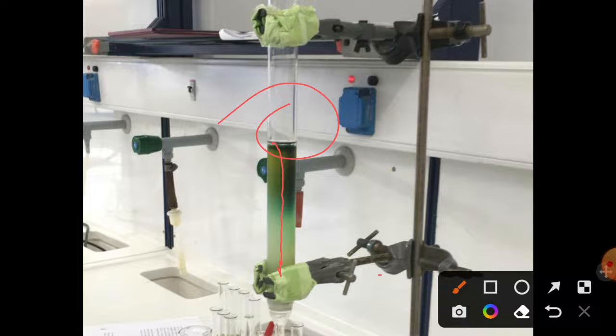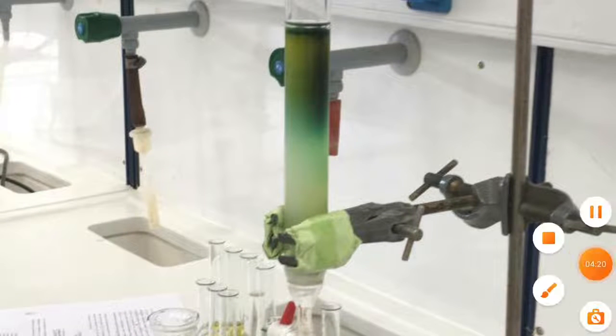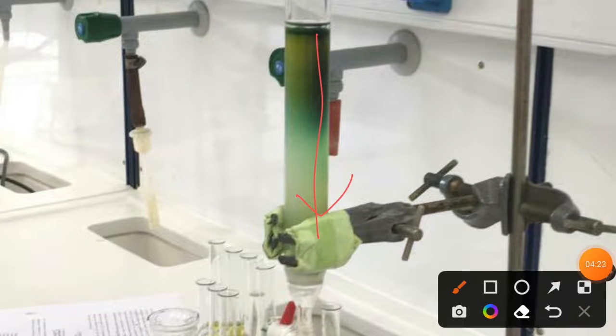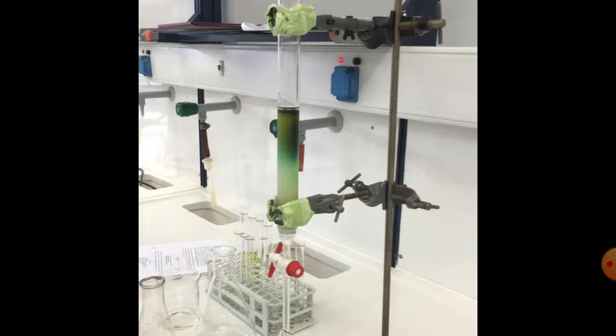Here larger molecules will move slower because they will experience some hindrance during their travel through the solid phase, but small molecules will exhibit less hindrance during their travel. So remember very importantly that small molecules will separate faster than the larger ones. That means small molecules will elute out fast. That is the concept of column chromatography.